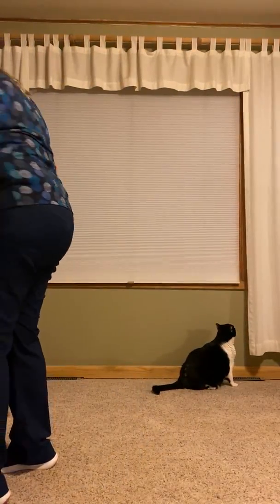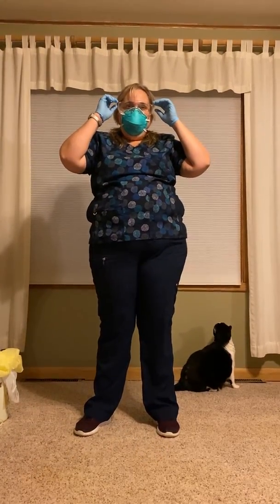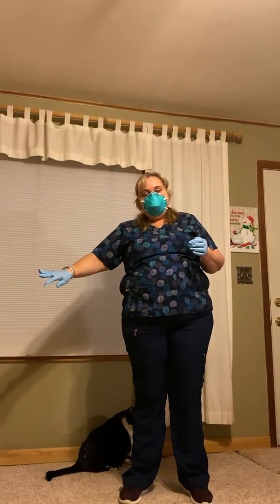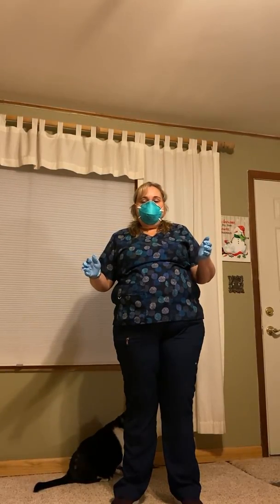So I'm hanging that up. We'll pretend that I'm doing that. And now I'm going to take my glasses off. All right. Now I still have my mask and my gloves. I am going to step out of the room at this point. Make sure the door is completely shut. And now what I'm going to do first is my mask.